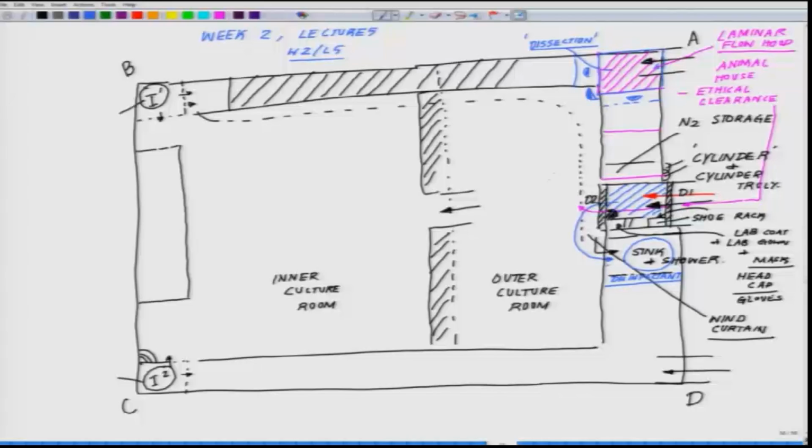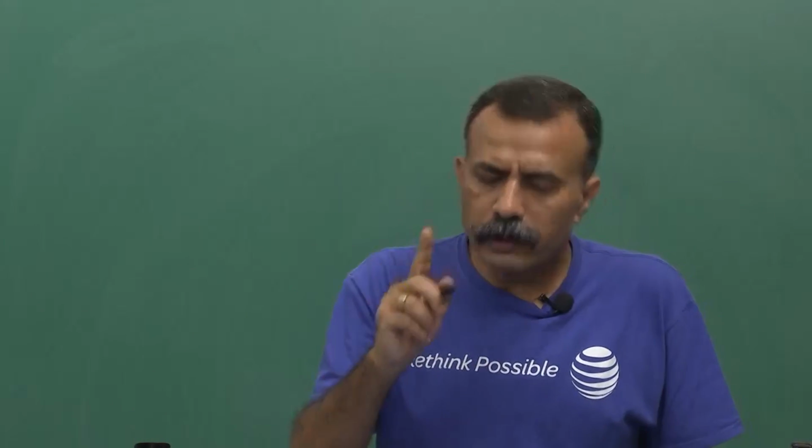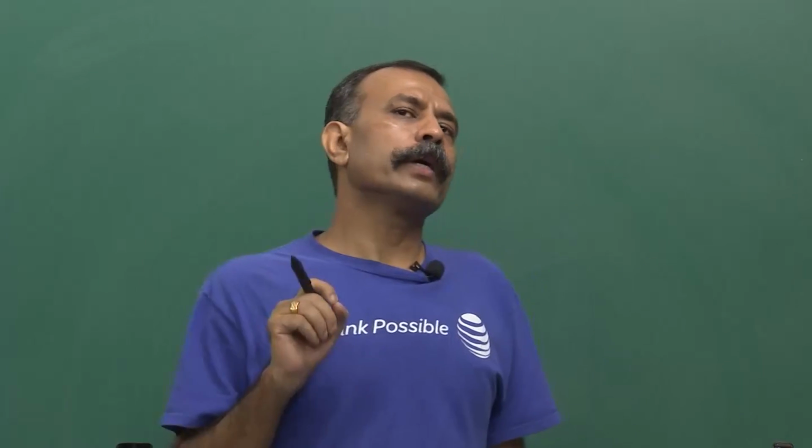You get the animal inside, right. So, here you are getting the animal inside the facility. Now, you have to have a setup for sacrificing the animal. Sacrificing the animal means you have to kill the animal, and say, for example, we consider that you will be using mice or rats or something. In the last class I told you that you needed the animal ethics committee's clearance. So, that is where you have to get your clearance.